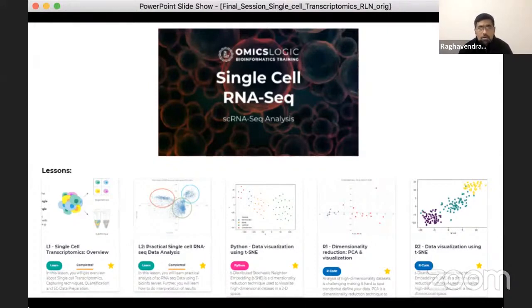I encourage you all to go through the lessons and experience the single cell analysis pipeline, so that you can develop an appreciation for the potential that single cell RNA-seq analysis has in answering key biological questions that bulk RNA analysis cannot.